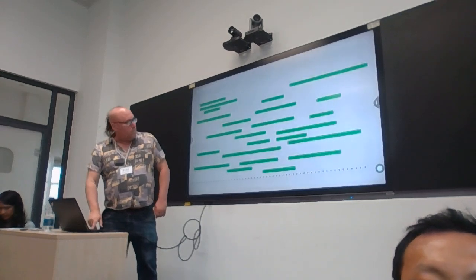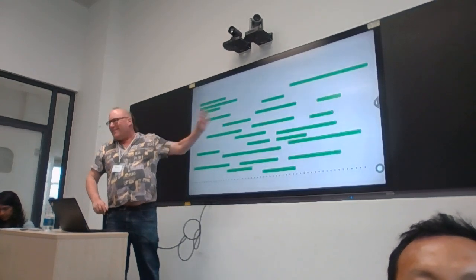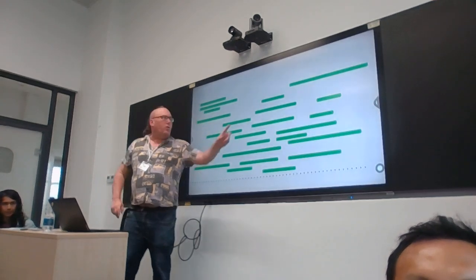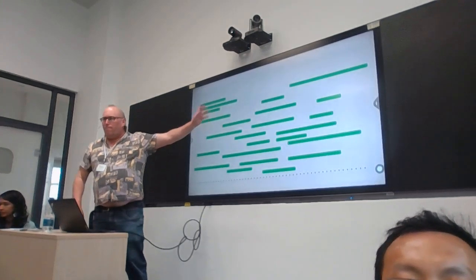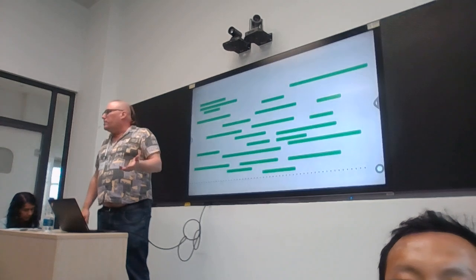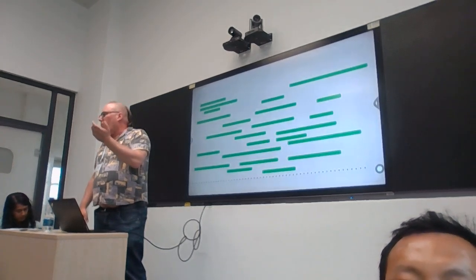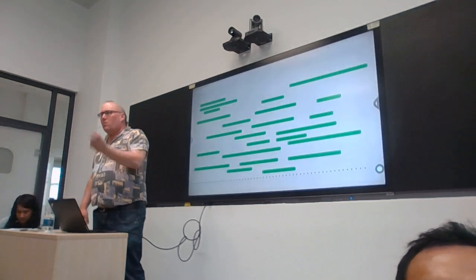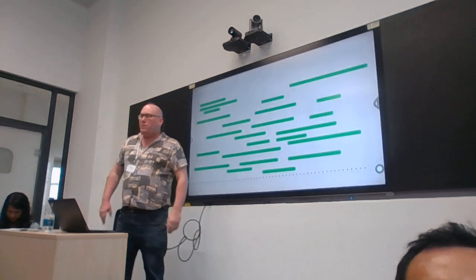So before I go onto this thing, let me actually get into this thing, okay? So the basic technique: we start with this. These are reads of DNA, okay? Which format do we get reads in? What's the format that we get reads from our sequencer in? The file format. FASTQ, right? Which is the quality and the sequence, right?